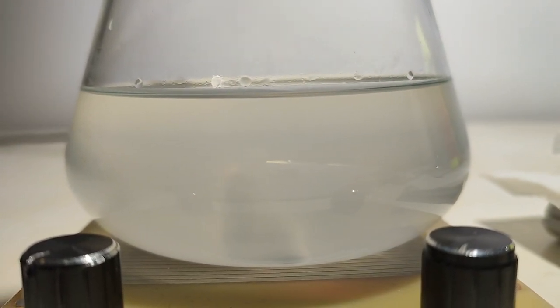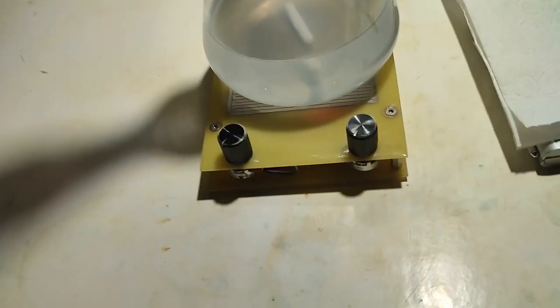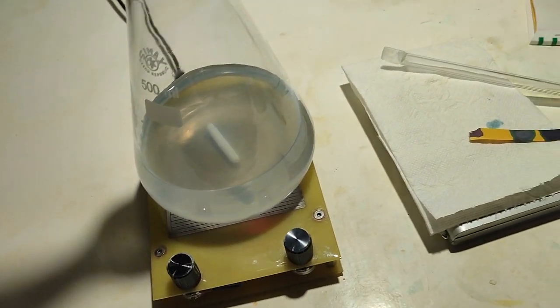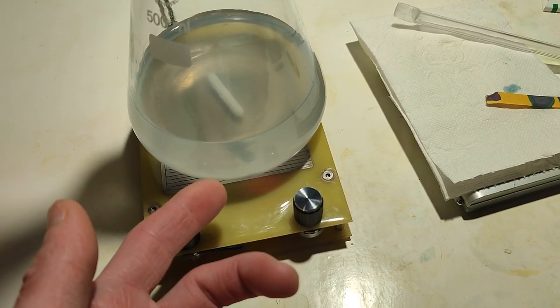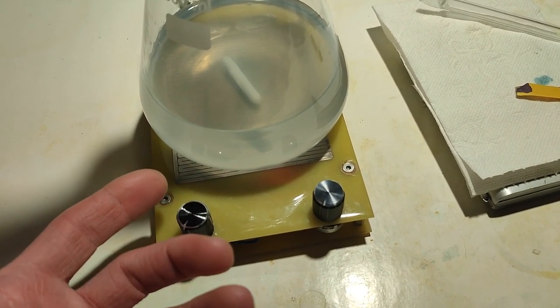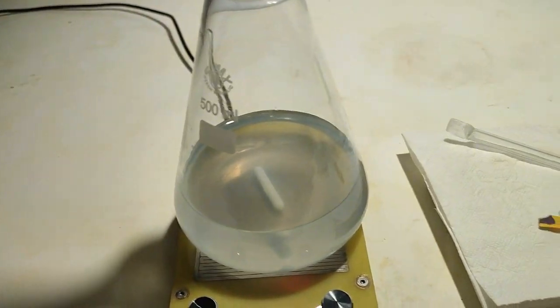As you can see, the solution is a little bit milky in color, and I guess this would be normal. The thing to keep in mind is that the methacrylate will polymerize. I would think that it will polymerize even when it is a salt. This way you probably get this super absorbent polymer stuff. It can absorb a lot of water but still remains solid.